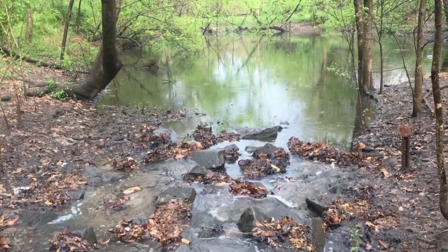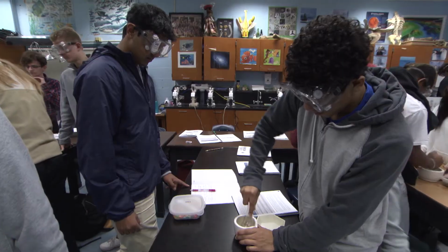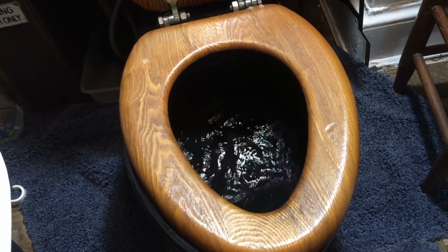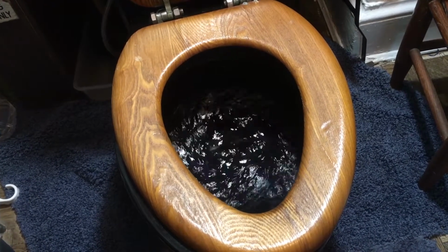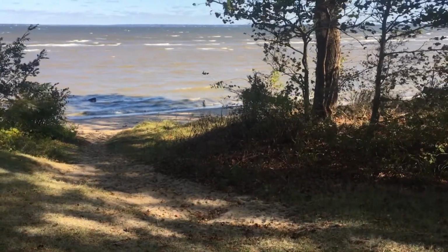We're going to show you an amazing process of wastewater treatment in a lab called the Science of Wastewater. You will be participating in the virtual adaptation of this in-person lab, and you will be seeing footage of students that shows you how the lab is conducted in a classroom setting. The goal of this program is to demonstrate how wastewater leaves your homes through toilets and drains and ends up as clean water back in our local waterways.